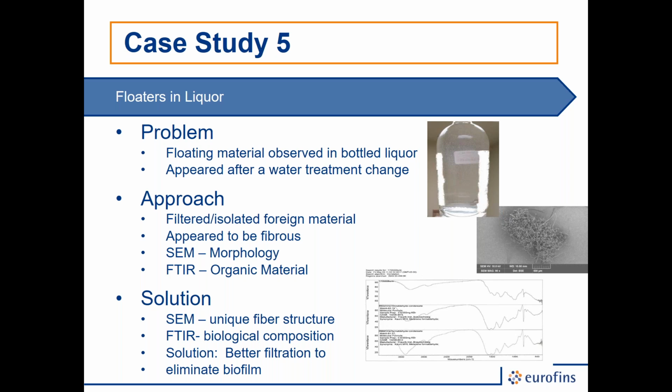We did an IR on it. The IR analysis allowed us to see that it was composed of both cellulosic and protein components. And that combination of cellulose and protein tells us that what you've got is a microbial source. And so this was clearly a biofilm related material.